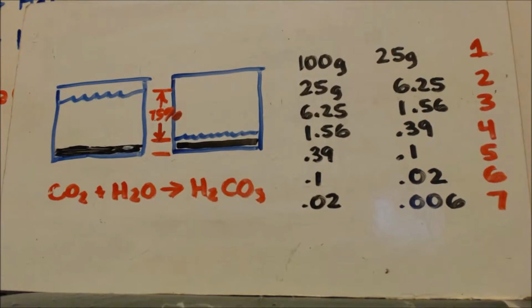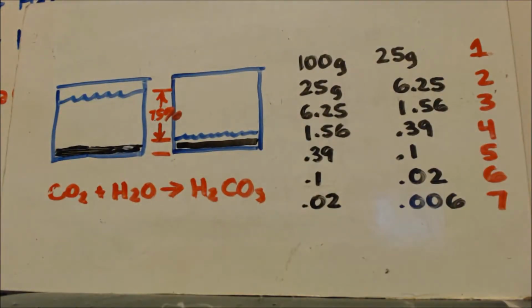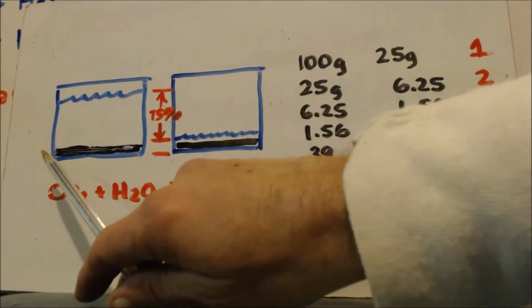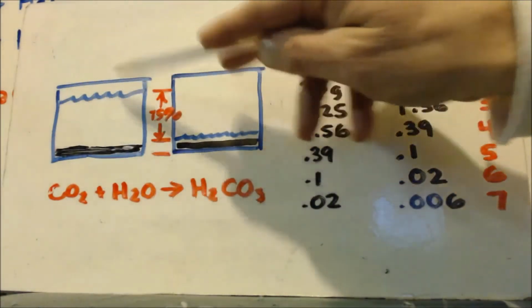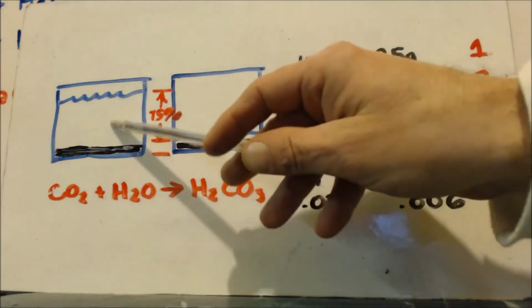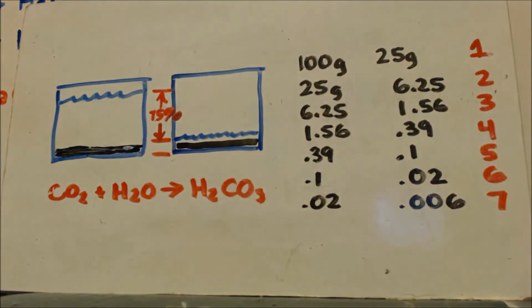Okay, so what I do is I put it in a bigger container, right? I just mixed those two together. Here's my precip down at the bottom, my hydroxide I just made. And I fill that container all the way up, a big container, with water. Now the sodium chloride, or whatever salt is left, it'll distribute itself evenly throughout that entire water, right?